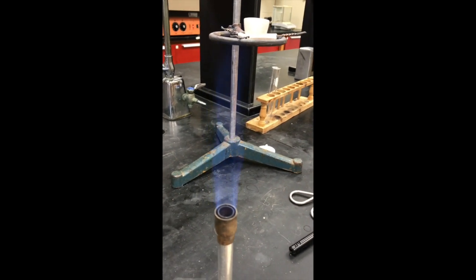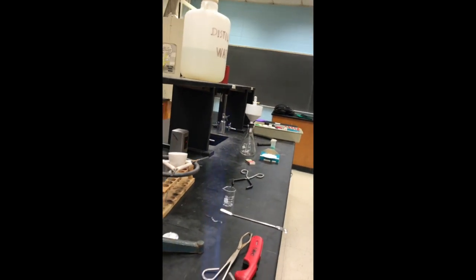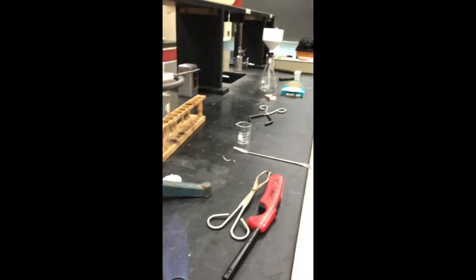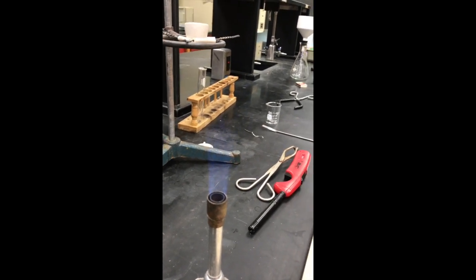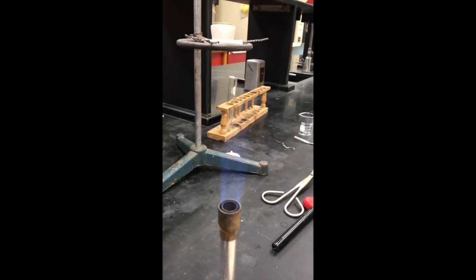And you can always adjust how much gas gets to the burner from the source. Here we're connected to the gas line, and perpendicular is closed, parallel is open. Right now it's kind of in between. If I turn this to completely parallel, it lets the full amount of gas through. But if I want to reduce the height of the flame, I'm going to turn this more perpendicular, and that's going to give us a nice small flame. You generally don't need a really tall flame. You generally only need a flame that's about 4 inches tall for most labs.